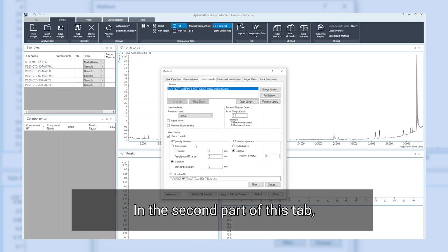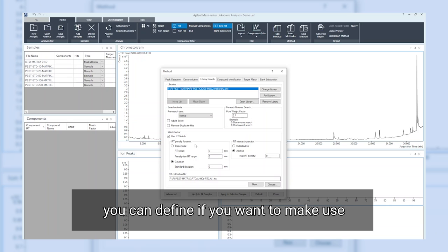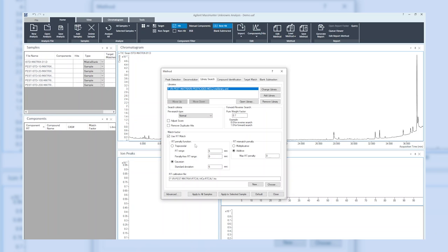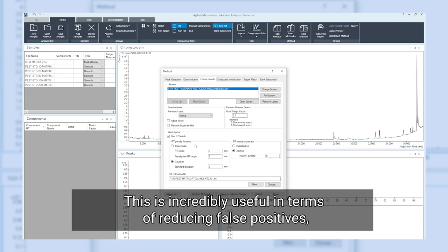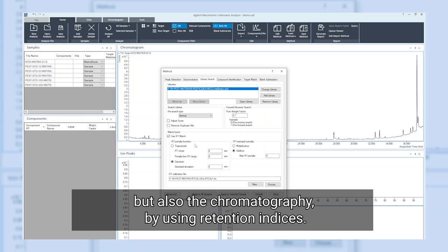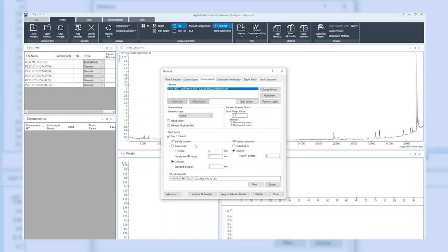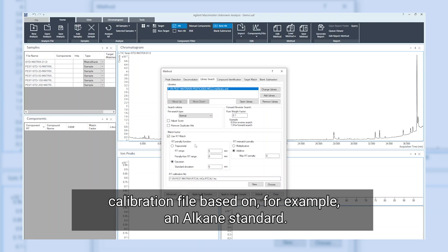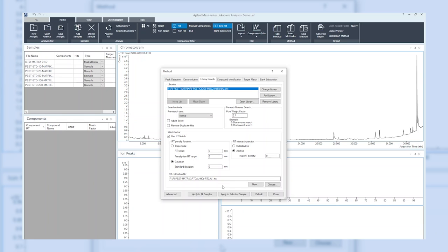In the second part of this tab, you can define if you want to make use of the retention time criteria. This is incredibly useful in terms of reducing false positives if you do not only consider the mass spectral match but also the chromatography by using retention indices. In order to make use of retention indices, we need to provide a retention calibration file based on, for example, an alkane standard.